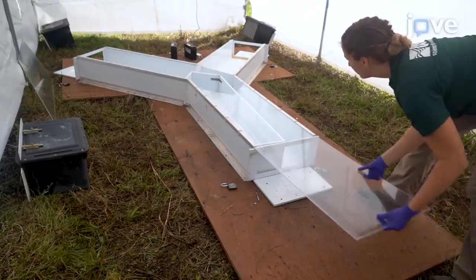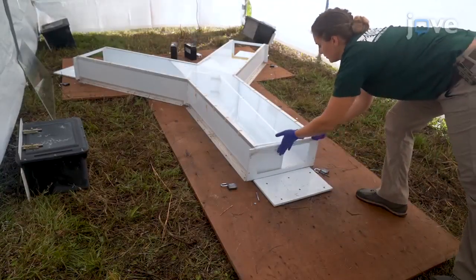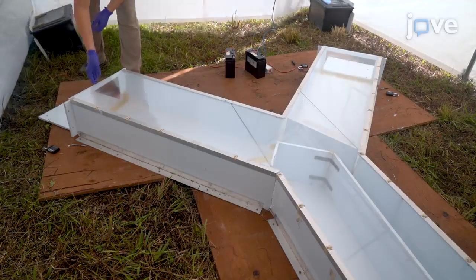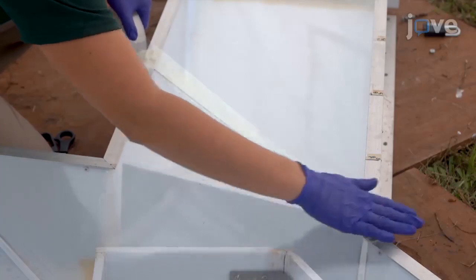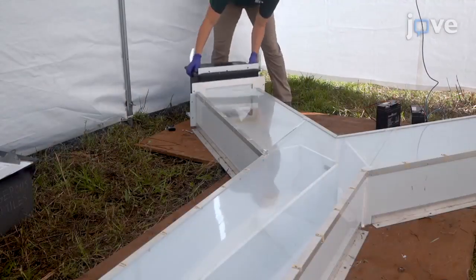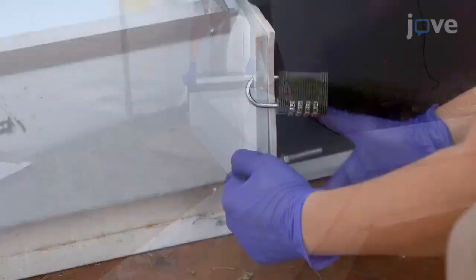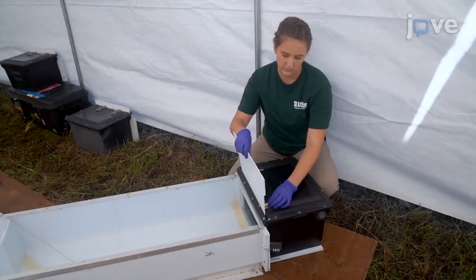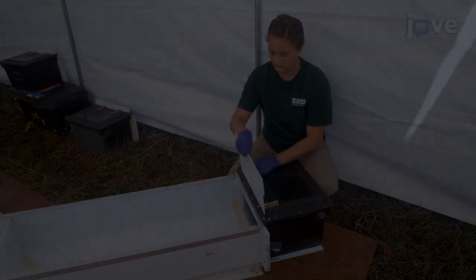Slide the acrylic top into place one section at a time and ensure that the angles meet completely. Use clear plastic tape to cover any gaps. Attach both arm boxes to the maze by connecting the faceplates with wing nuts or padlocks, and ensure that the doors are locked open.